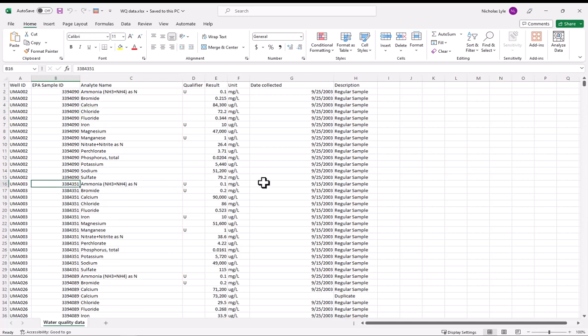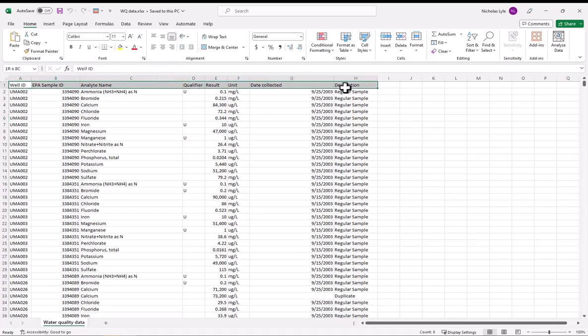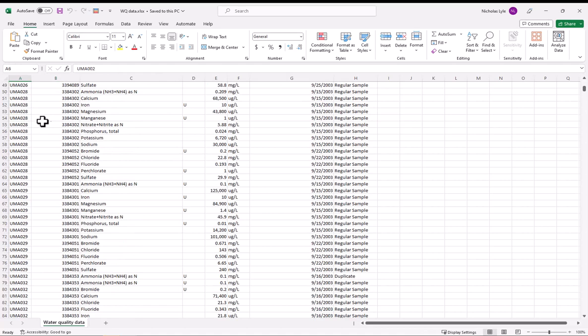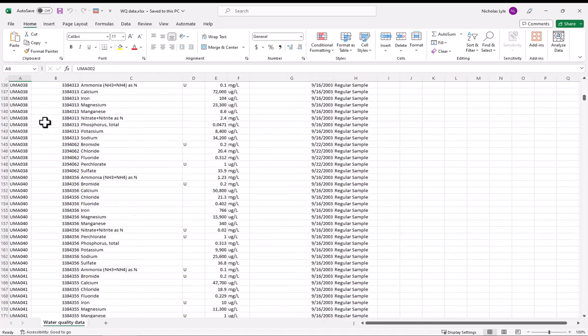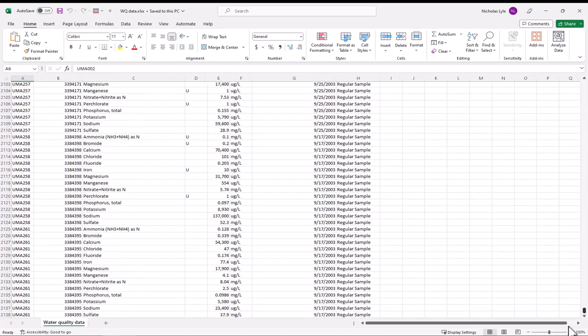Another thing that I want to note here is that I've actually done a little bit of preprocessing. I haven't fully preprocessed this, but I've still made sure that I'm able to bring this into AquaChem at all. In general, the more preprocessing of the data that you do outside of AquaChem, generally, the easier it is to bring it into AquaChem. So one thing to notice here, we don't have any extra rows or columns. So notice how we've just got one header row and then our results. And then if I scroll to the bottom, that's it. That's all we have is the results.